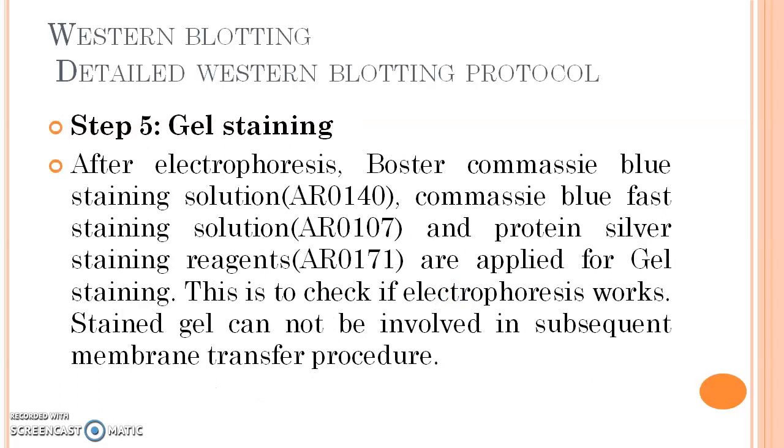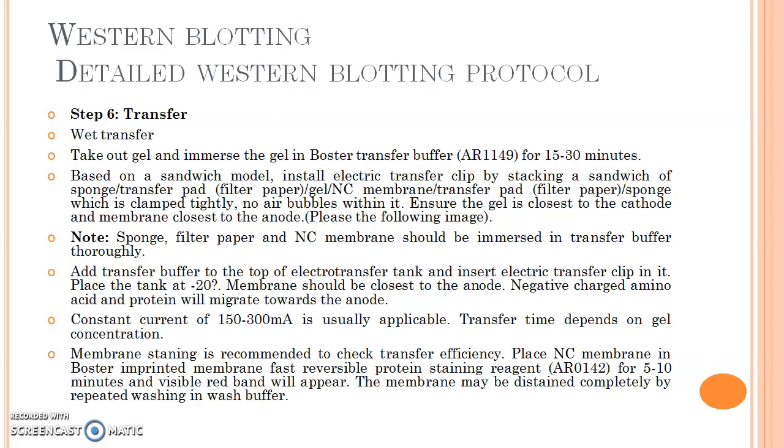Step 5 is gel staining. After electrophoresis, Booster Coomassie blue staining solution, Coomassie blue fast staining solution, and protein silver staining reagents are applied for gel staining. This is to check if electrophoresis works. Stained gel cannot be involved in the subsequent membrane transfer procedure.